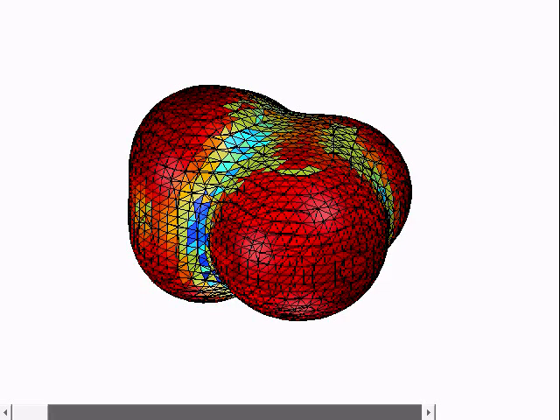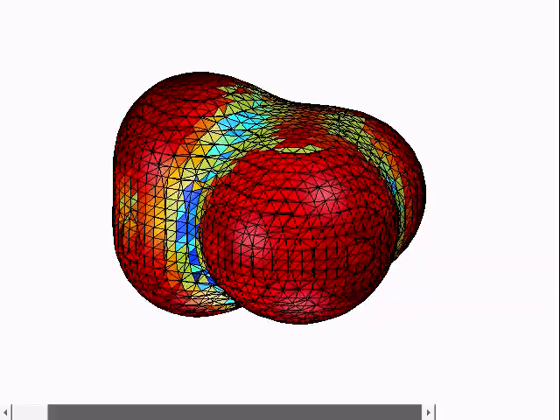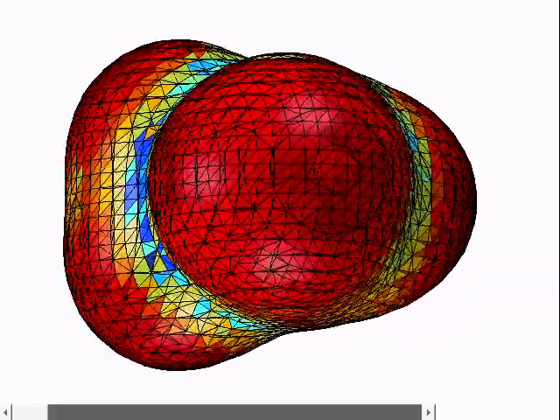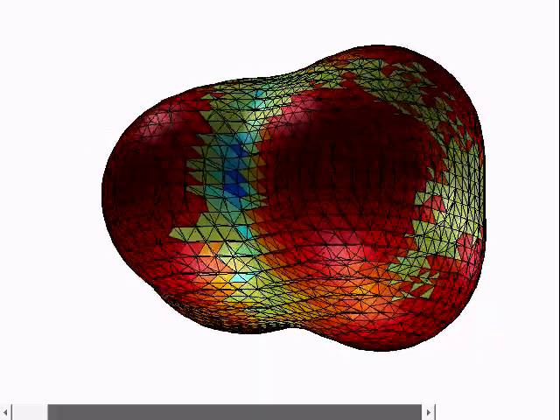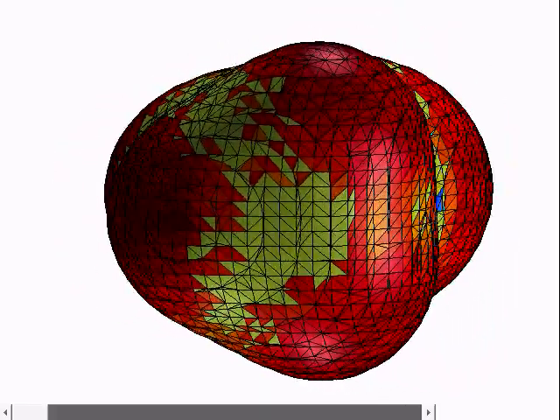Here we have colored the isosurface by curvature. Red means higher curvature while blue means lower. We use a non-standard measure of curvature which is defined in the abstract. The key observation behind our sphere fitting method is that spherical patches are contiguous regions of high curvature bounded by regions of low or negative curvature.